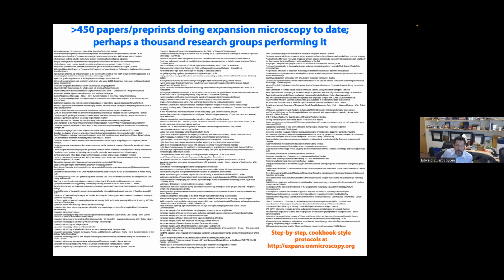So to summarize, expansion is spreading very quickly. And I think part of the reason is that anybody can optimize it for their purposes. People are taking it down to nearly atomic scale. People are taking it to nearly or even the entire body. It's being applied to different kinds of tissues, different species. The list goes on and on and on.